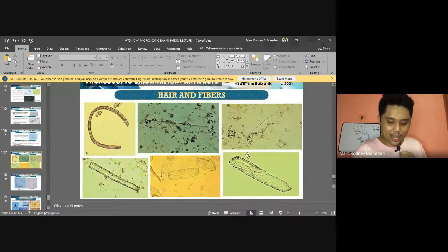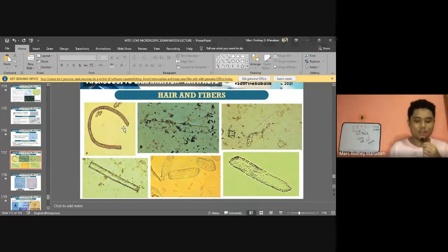As you can see, ang sides po niya, dires, nasa imuhang right, kay na yung mga nodules, dili siya smooth, so that's not also a cast. Kani siya, dears, as you can see, mura dyan siyag cast, no? Pero as you can see, kaning end niya, dili siya circular or blunt. Nasa yung murag mga nodules pa rin or na yung mga murag buslot-buslot. Okay? So take note lang, dears. Again, the middle should be thicker than the sides. And the sides should be lighter in color. Dapat dili siya dark edges. Okay? Dili dark edges. Okay? That's the difference between your fibers and your cast.